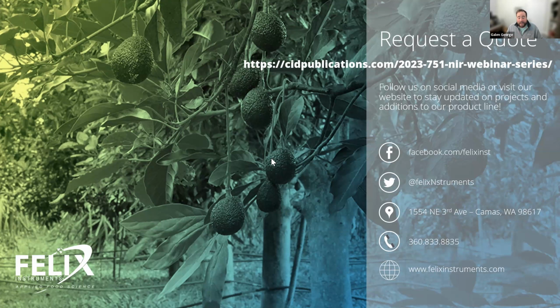It really is application specific, but in the use case of, I need this model to work over multiple seasons on a single instrument for a single commodity, single variety of a single commodity in a single region, then at the very minimum, you're going to need more than one season's worth of data in that model. And that's if all your other variables hold constant as well.